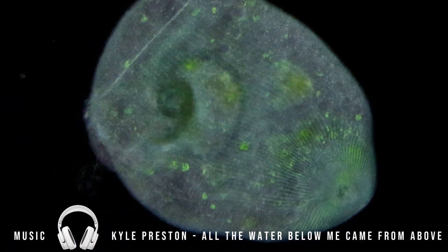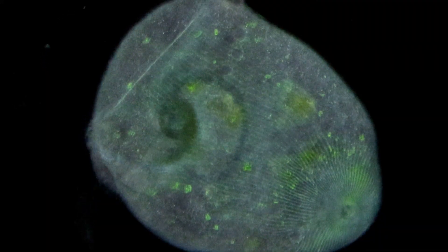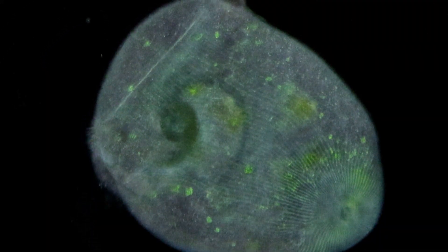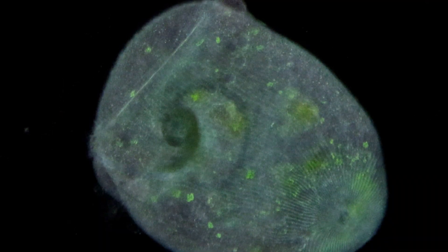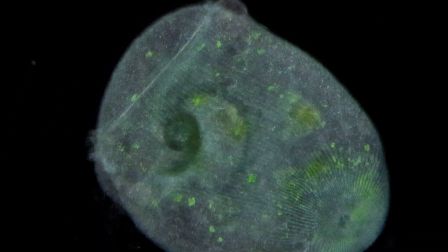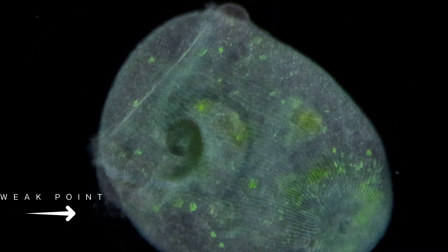This is a stentor, and in this video you'll see the death of a stentor. I captured a small mini time-lapse of this individual that passed away. It's quite interesting how quickly the cells deteriorate, and you'll see that later on in this video.